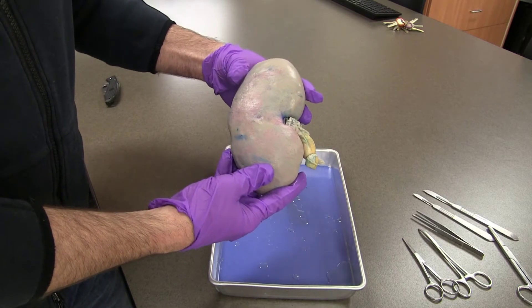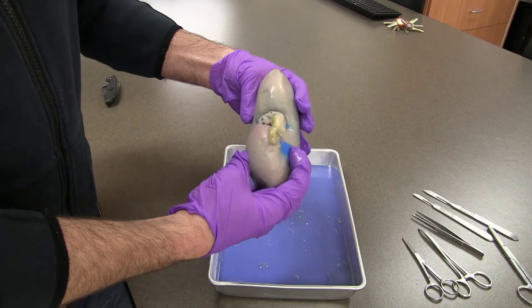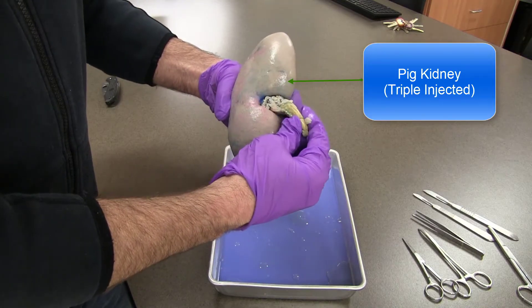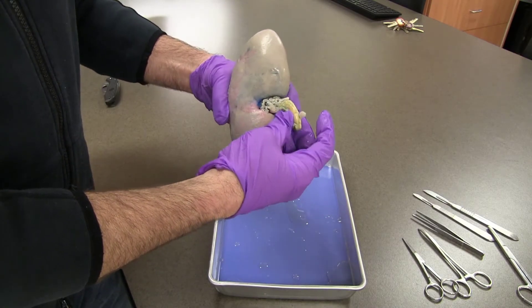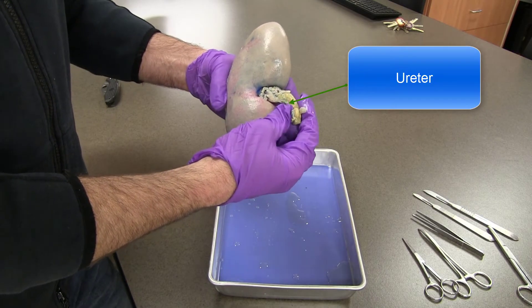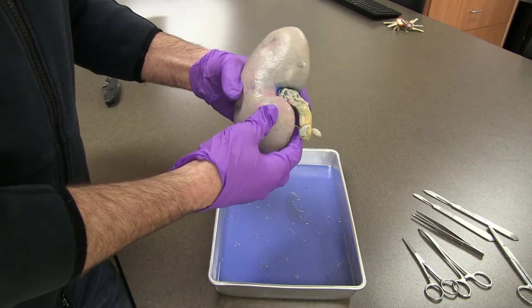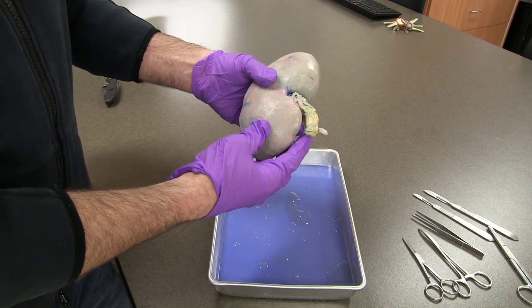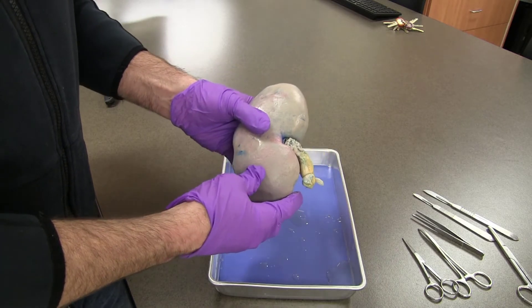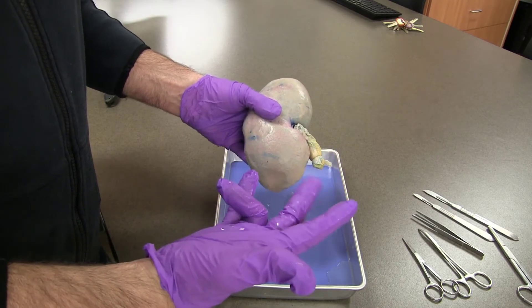Today I'm going to be dissecting a kidney that has been triple injected. This is actually a pig kidney — it's larger than a human kidney. They've injected three different types of latex coloring: yellow latex in through the ureter, red latex in through the renal artery, and blue latex in through the renal vein. So we're going to get a perfusion of these colors in the areas where you would expect to see oxygenated blood, deoxygenated blood, and urine in the kidney.